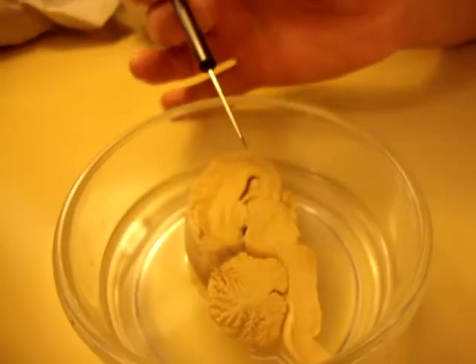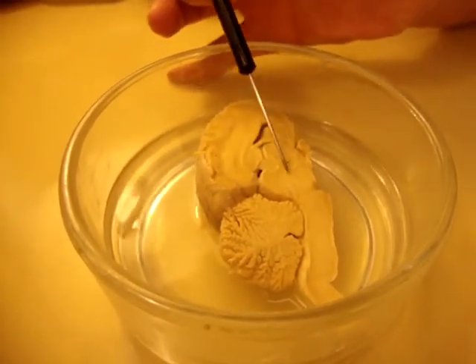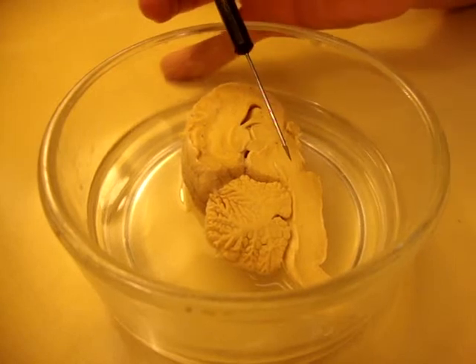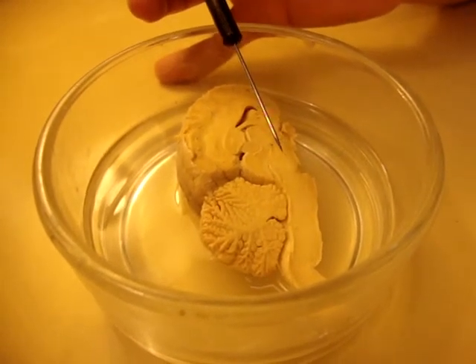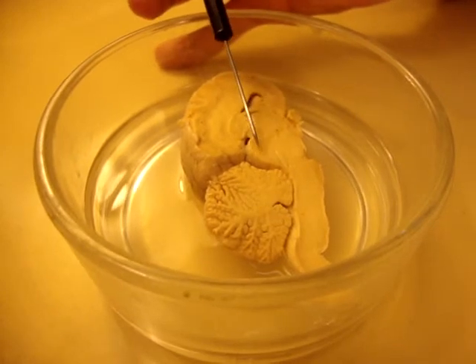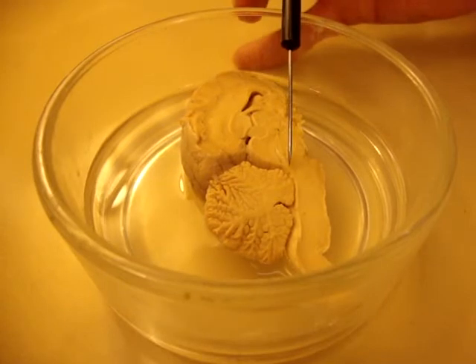Moving into the midbrain, you've got the mesencephalon here. You've got an optic lobe, an auditory lobe. The optic lobe has the slight discoloration. The auditory lobe, and this is your cerebral aqueduct.